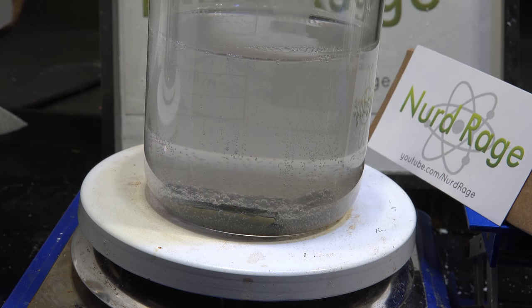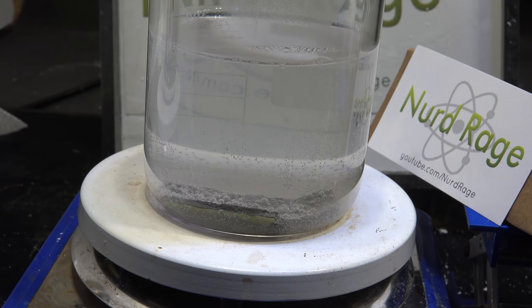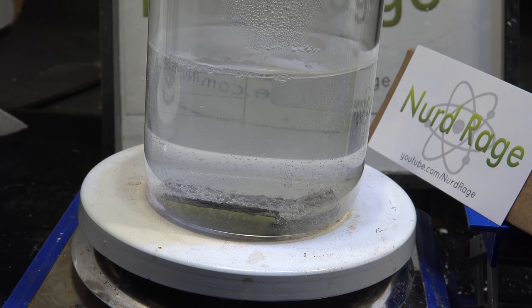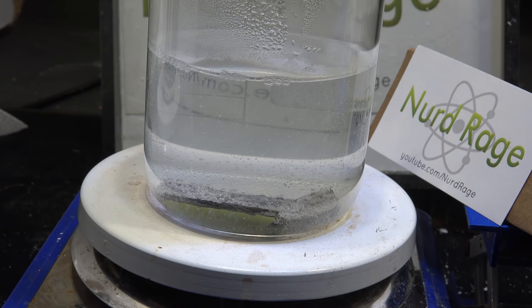We need to increase the gallium content of our gallium aluminum alloy to start the process going. I'm not going to add extra gallium though, because gallium is expensive and I don't want to risk wasting it. So instead, we're going to go in the opposite direction and force the destruction of some of the aluminum by reacting it with sodium hydroxide.